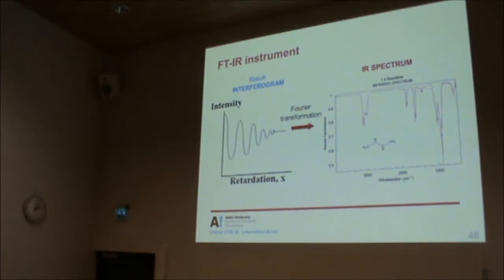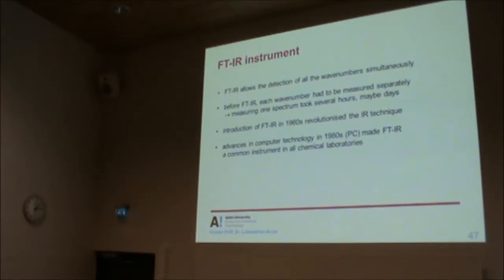So now we are going to send an interferogram which has multiple frequencies, and you're going to deconvolute the interferogram and then get individual peaks. FT stands for Fourier transform, the mathematical treatment that the computer uses to deconvolute the spectrum.